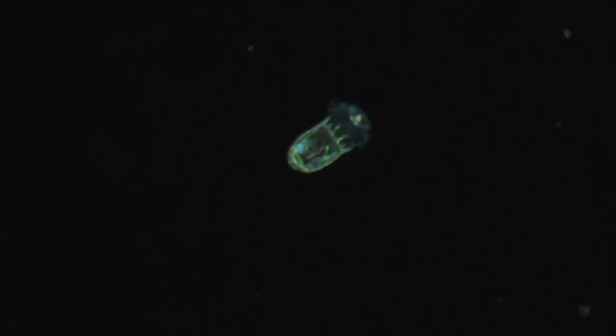And that is the third objective, which would be 1,000 times magnification. The second objective would be 400 times. And the first at 100. That does not correspond to the relative size of the things that you're looking at. It's the magnification level of the lenses. I guess that's a question that gets asked on my Journey to the Microcosmos all the time.